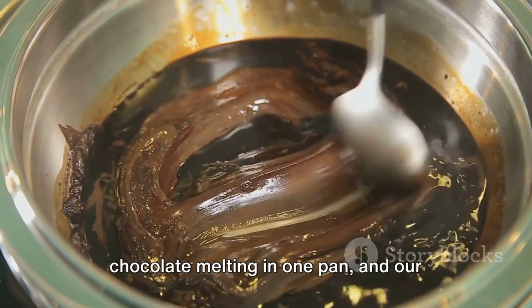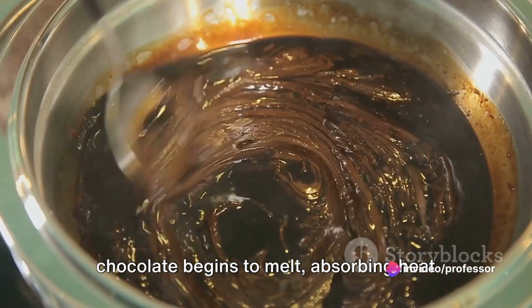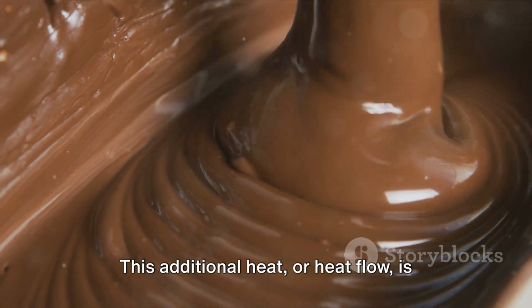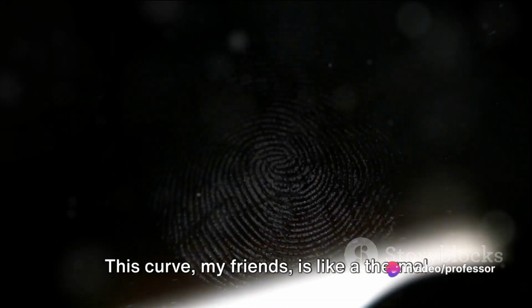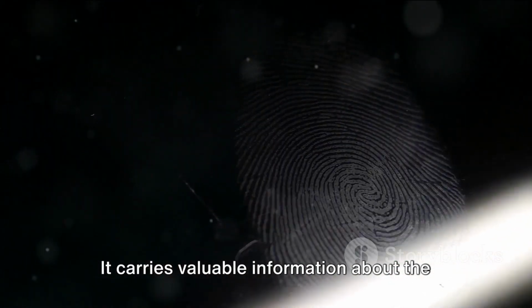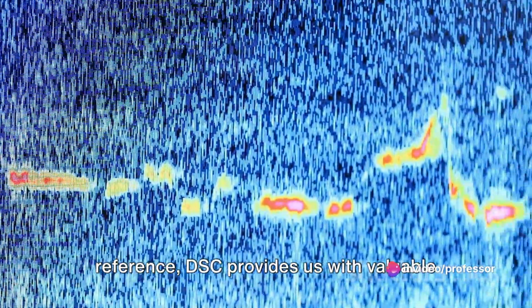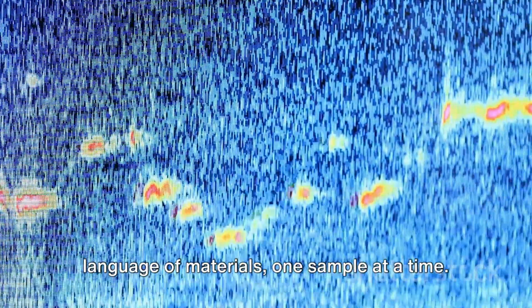So let's say our sample is a piece of chocolate melting in one pan and our inert reference is an empty pan. As we start heating both pans, the chocolate begins to melt, absorbing heat in the process. So DSC, being the vigilant observer, detects this and adds more heat to the sample pan to keep the temperatures equal. This additional heat or heat flow is then recorded against temperature or time, creating what we call a DSC curve. This curve, my friends, is like a thermal fingerprint of the sample. It carries valuable information about the sample's thermal properties, such as its melting point, heat capacity, phase transitions, and much more. So by comparing our sample to a reference, DSC provides us with valuable insights about the sample's thermal properties. It's like deciphering the thermal language of materials, one sample at a time.